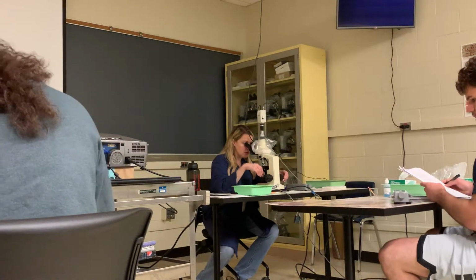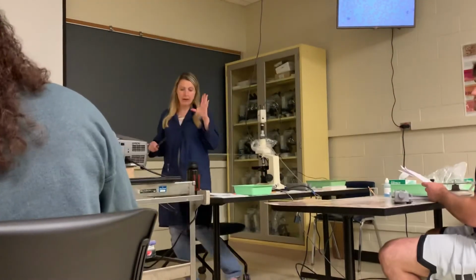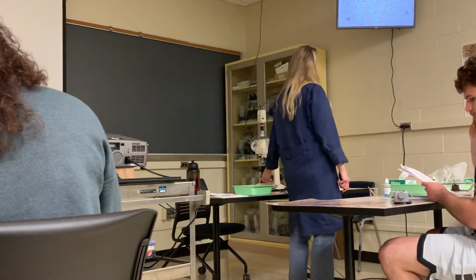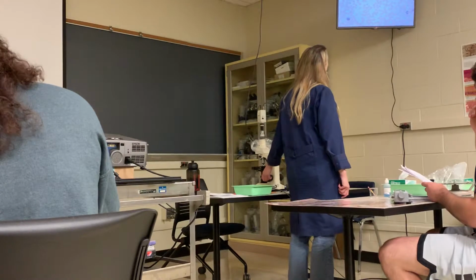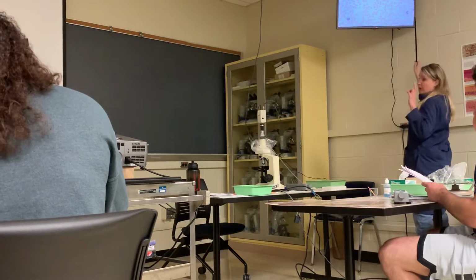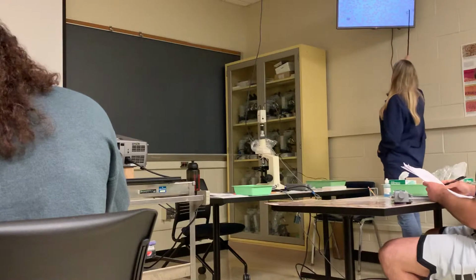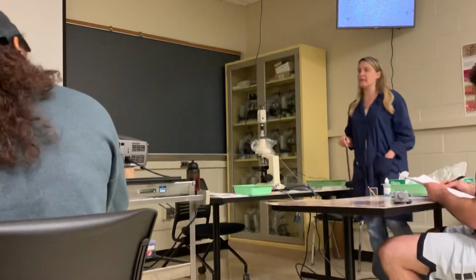Okay, so if you remember from the last class, there are 5 different types of white blood cells. 3 of them have granules and 3 of them do not. I'm sorry, 2 of them do not. In this slide, we can see 2 granular leukocytes here and here. These are the most abundant white blood cells, so these are going to be neutrophils.